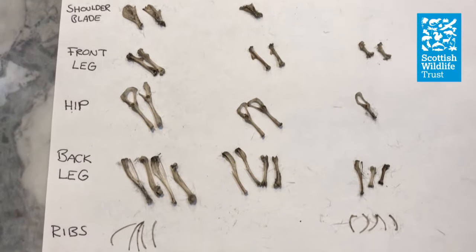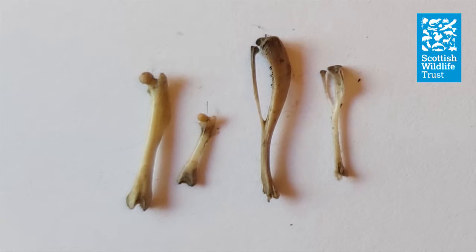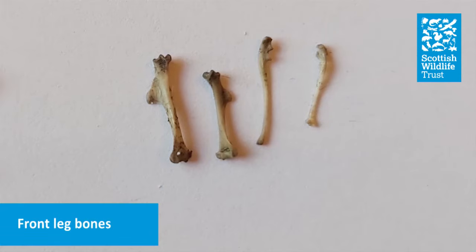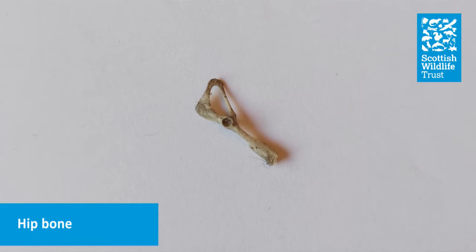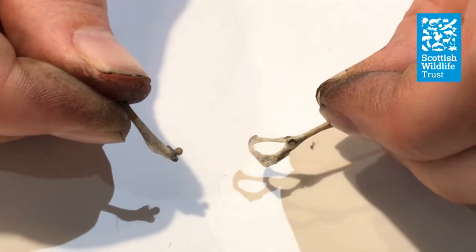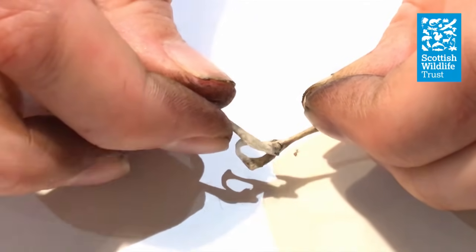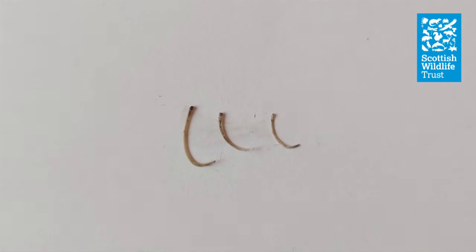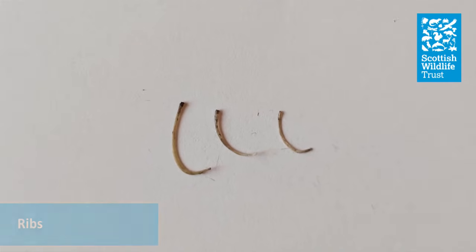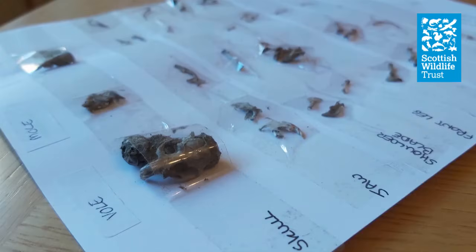Now we'll take a look at some of the other bones that you'll find in your pellet. Here we have the back leg bones — the two on the left are thigh bones and the two on the right are lower leg bones. And here are some front leg bones — the two on the left are upper arm bones and the other two are the lower arm bones. Another large bone you're likely to come across is the hip bone. If you take one of your thigh bones you'll see there's a small ball on one end that fits exactly into the socket on the hip bone, and that's what allows the leg to move. This wide flat bone is the shoulder blade. And these thin bendy ones are ribs. You'll likely end up with a lot of different shaped small knobbly bones — these are the back bones or vertebrae. Once you've identified all of your bones, why not stick them to a piece of paper with some sellotape to create your own ID guide. And of course don't forget to wash your hands when you've finished dissecting your owl pellet.